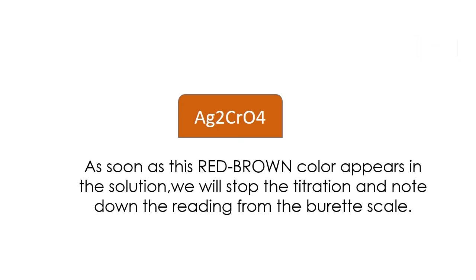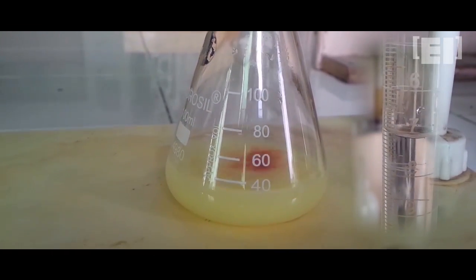As soon as this color appears, stop the titration. Note down the reading from the burette scale.